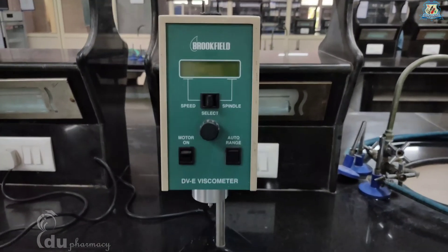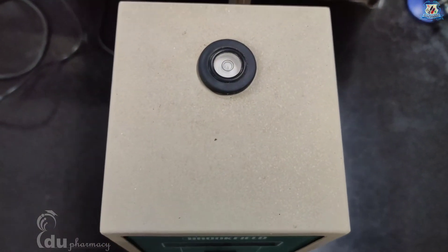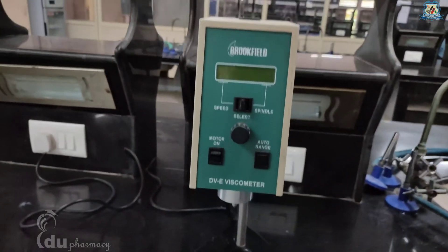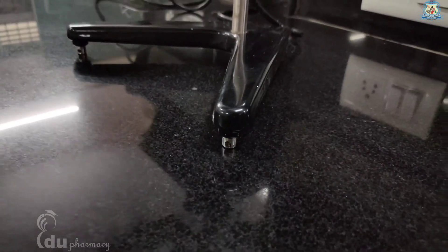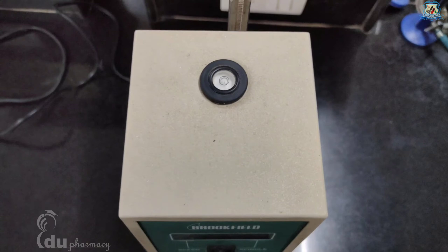Now let's come to the operating procedure. The first thing you need to do is level the instrument. The level is adjusted using the three leveling screws on the base; adjust so that the bubble level on the top of the DVE is centered within the circle.